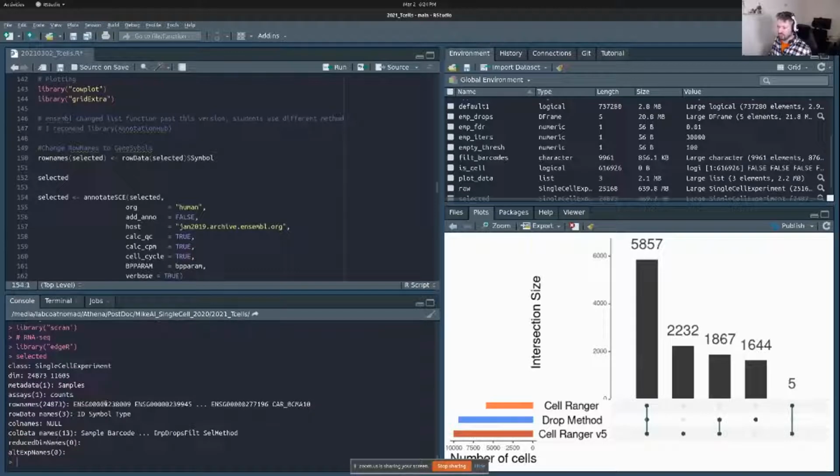Yeah, so you can see the row names are the long gene names, right? And that's not going to be very useful for us to explore the data with. We're not going to copy and paste all these into GeneCards when there's hundreds of them and we're like, oh, that looks interesting. No. Luckily, with Cell Ranger now, they're actually doing a database query in there. I used to have to do a script that would do the annotation using a database. You don't have to. It's in the data set now. You can just change it, and this one line of code does it. And now, oh look, it's gene names.